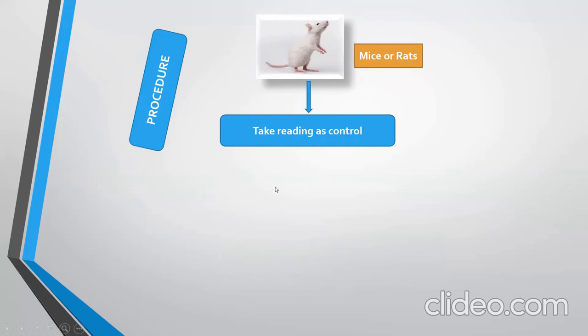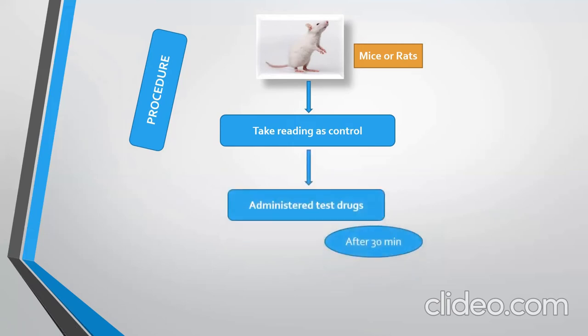Allow the animal to move around. Typically, the rodents will move around the periphery of the compartment until they find the door. Once they find the door, they will move from the light compartment to the dark compartment and back to the light compartment, and this process will take 7 to 12 seconds. Take the reading of the control animal, then administer the test drug by the suggested route and dose to the animal.